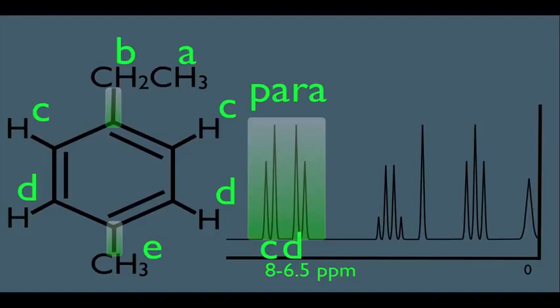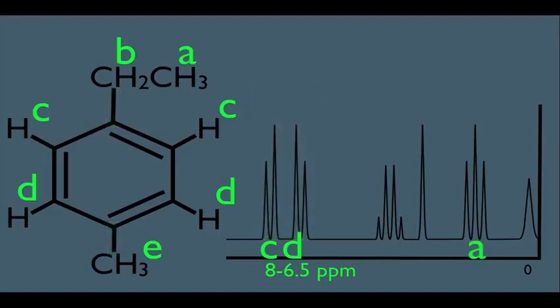Now, while we have this example in front of us, let's just finish it off just in case. These would be the A-type hydrogens right here. Notice they do have the B hydrogens as neighbors. There's 2 of them. 2 plus 1 is 3, so the A would be a triplet. That makes this signal right here the signal for the E-type hydrogens. And notice here they are. The neighboring carbon for them would be this carbon here.